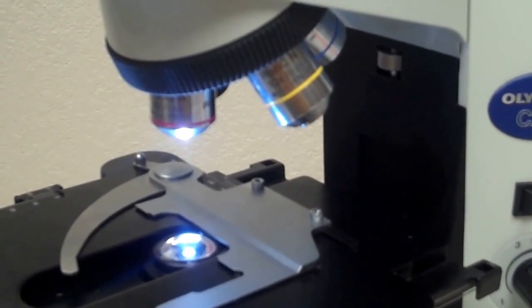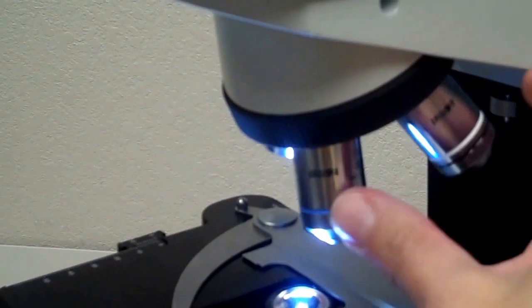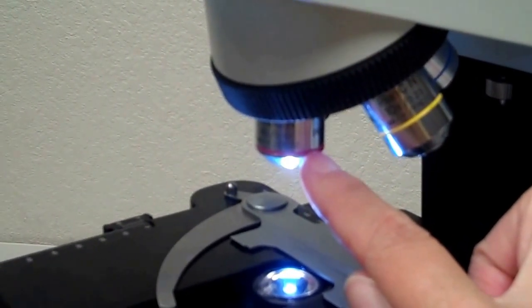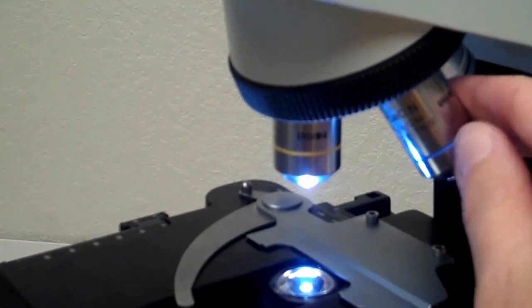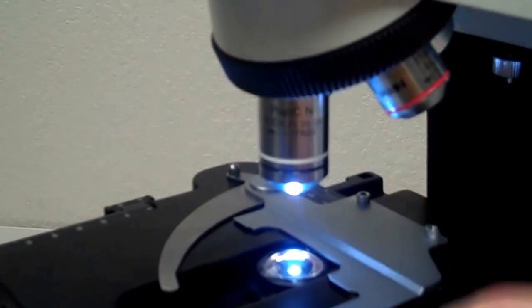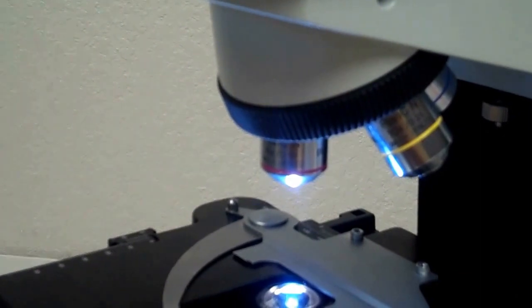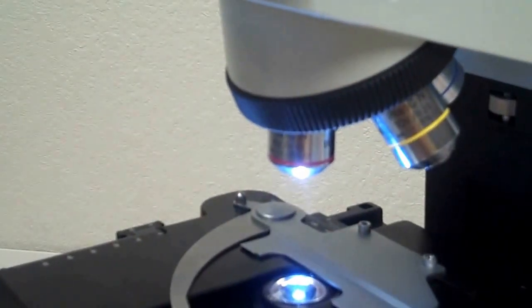The revolving nosepiece holds the objective lenses, and you can rotate it to put different objectives into place over your specimen. The red stripe lens is 4x magnification, called the scanning lens. The yellow stripe is 10x, called the low power objective. The blue stripe is 40x, the high power objective. The white stripe is 100x, the oil immersion lens. Total magnification is calculated by multiplying the ocular (10x) by the objective — for example, 10x times 4x gives a total magnification of 40x.